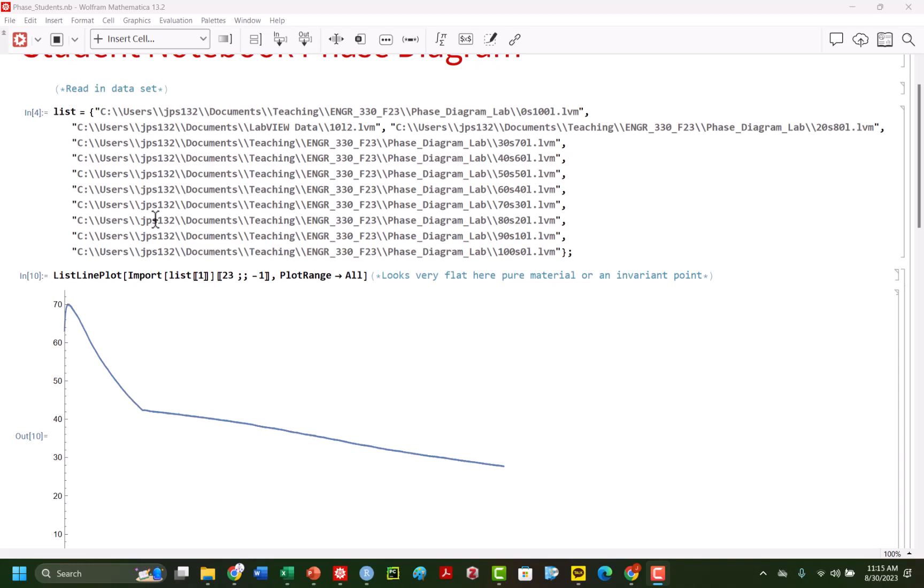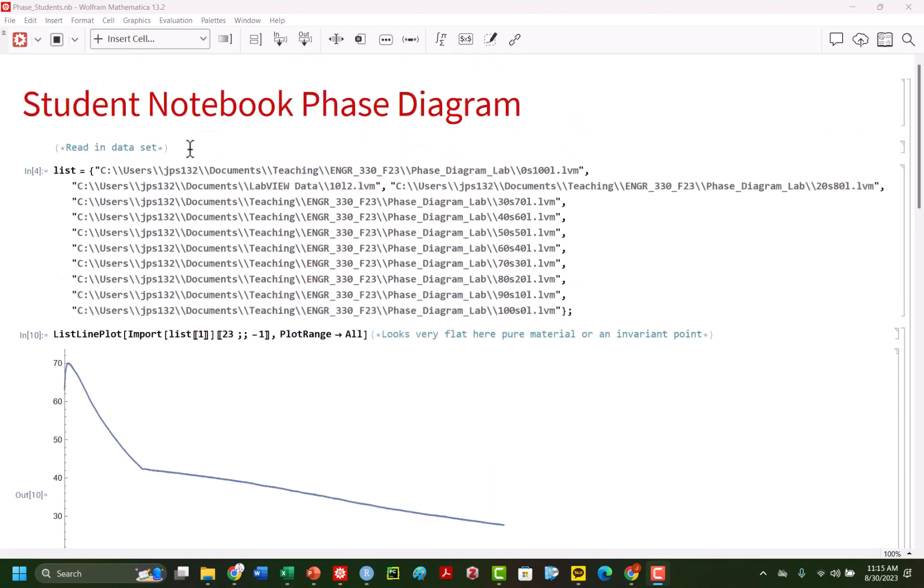Hello, we are back and we are going to now get into our data analysis from our experiment. So we've gathered our data, we're ready to roll. So now it's time to actually get to it and start to read in our data set.